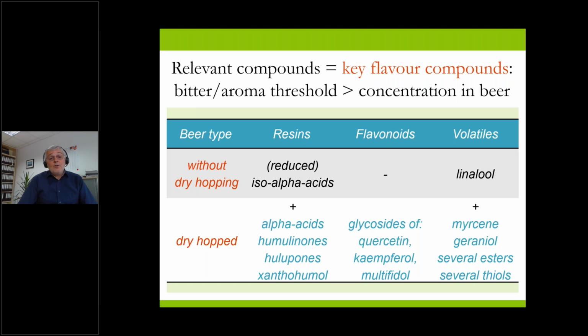And this slide shows you why it's not easy to analyze dry hop beers, why this is a complex matrix to be analyzed.